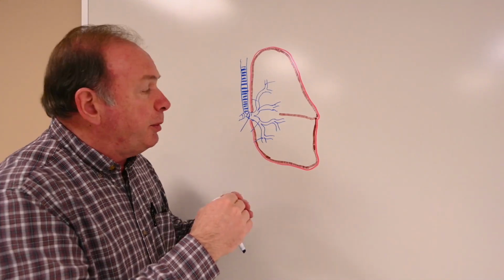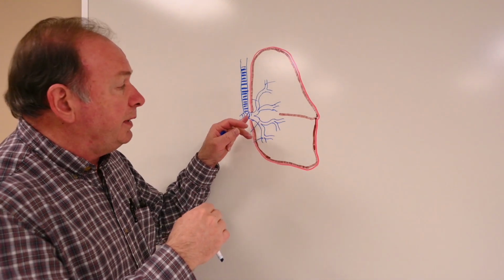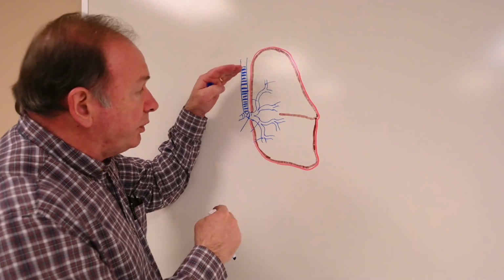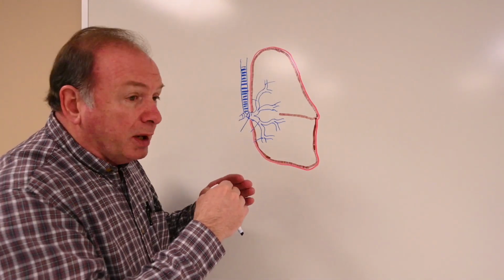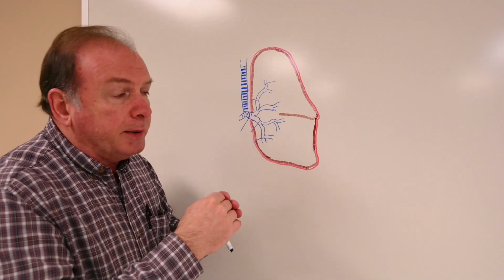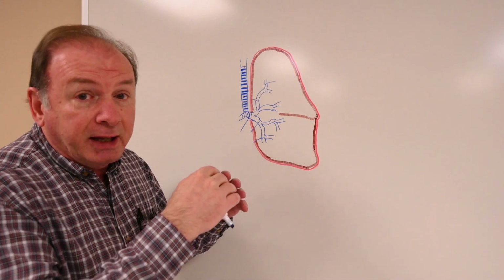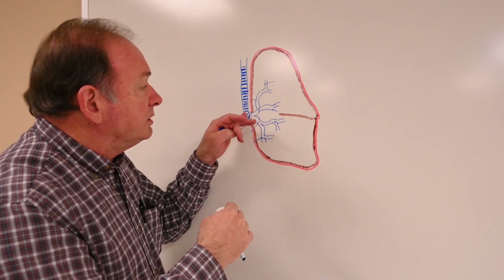So that underneath the epithelium, which is still a pseudostratified ciliated columnar epithelium with goblet cells, that same kind of respiratory epithelium we saw through the trachea, but underneath of that in the lamina propria, we start to see a mixing in of some of the glands and the smooth muscle, and there are blocks of cartilage.